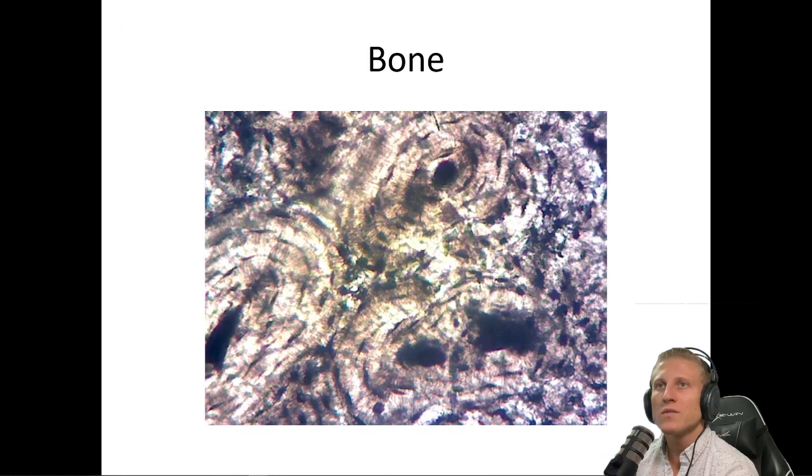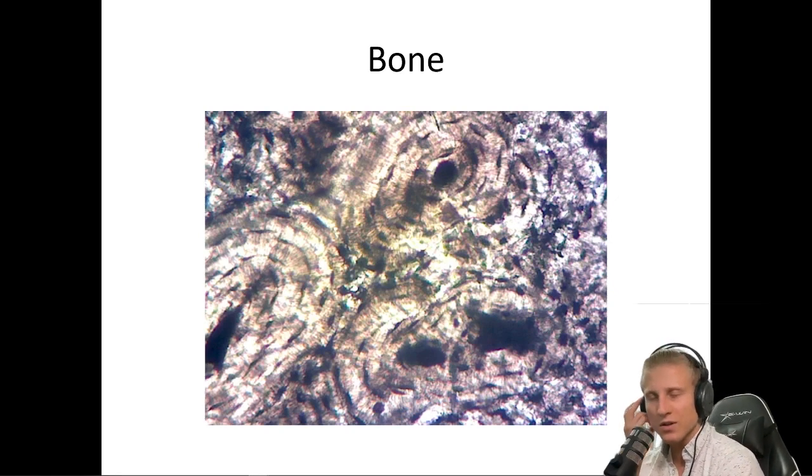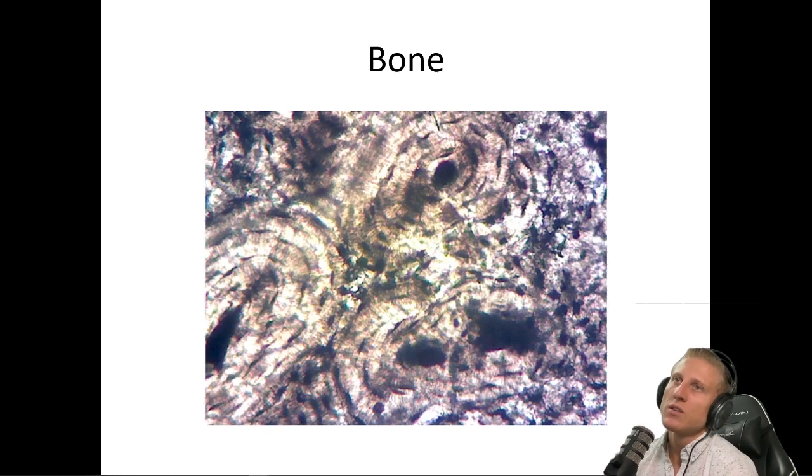I could go on into physiological function and then Wolff's law and bone reinforcement, that sort of stuff, but it's not relevant for our exam. This is a histological slide. So we can see again, here is an osteon right here. Okay. Cylindrical structure. These are individual cells in the matrix.